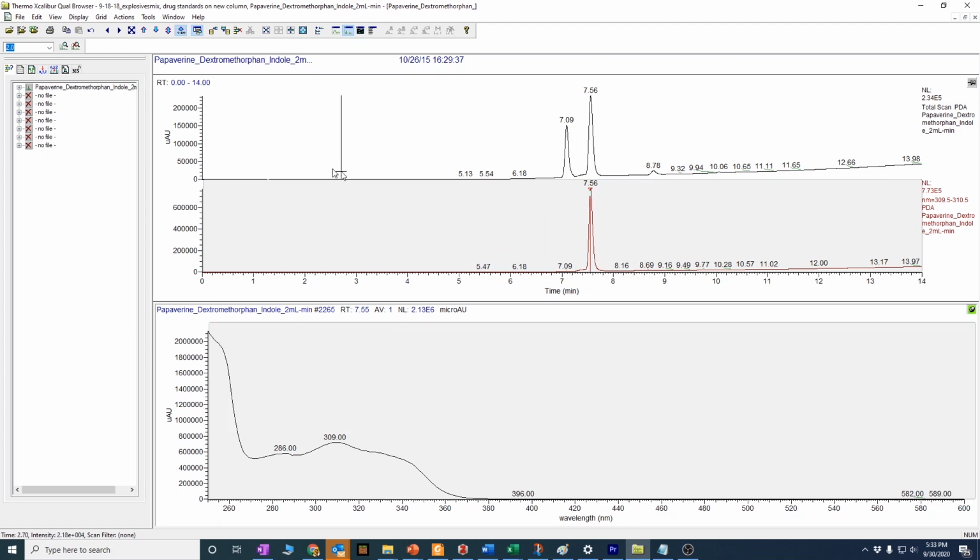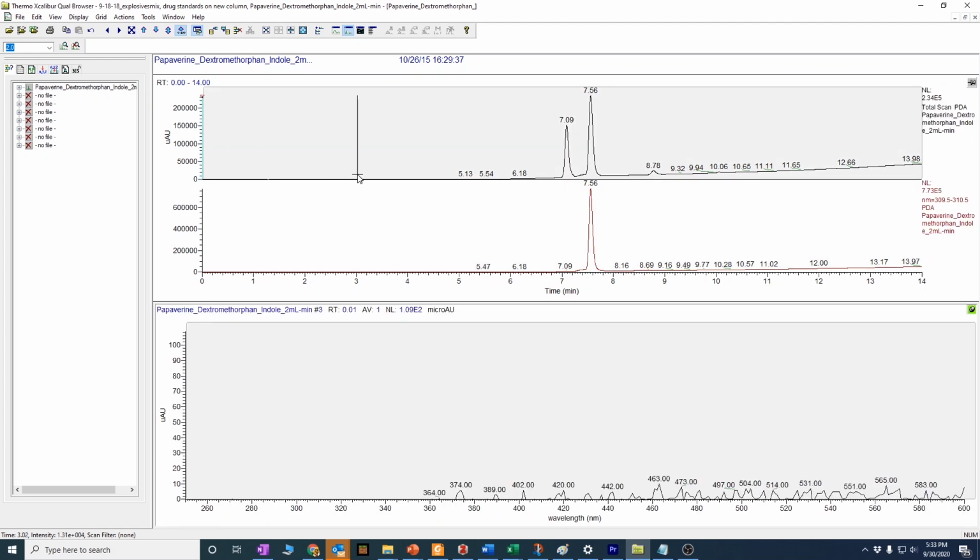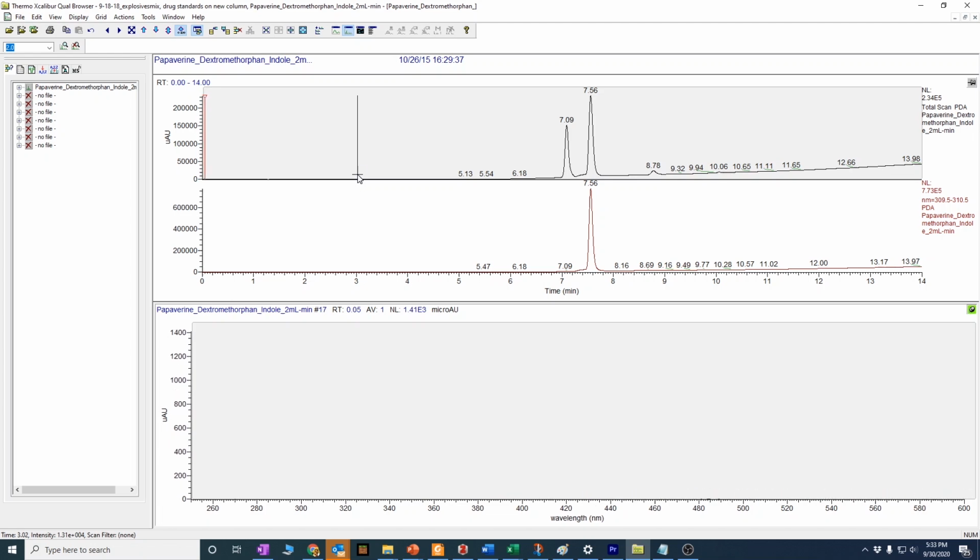So when you have three-dimensional data, as we call it, when you have a chromatogram where every point on the chromatogram represents another full set of instrumental data. So like I said here, every bit of data up here is actually a complete UV-Vis spectrum. And there's a lot of things that you can do with that when you have this three-dimensional data.